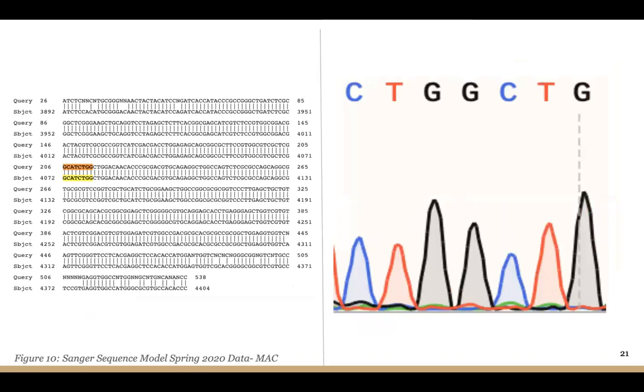In figure 10, the Sanger sequence shows a homozygous TGG that is supported by the single peak found at the mutation site in the alignment to the right. There are many factors that could have possibly contributed to the lack of a true mutant. However, we came to the conclusion that it was likely down to seed handling prior to planting.